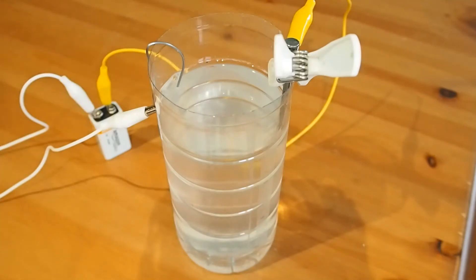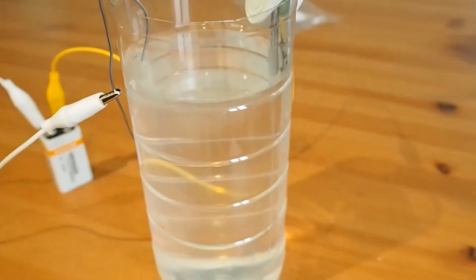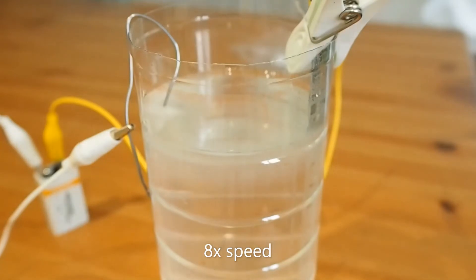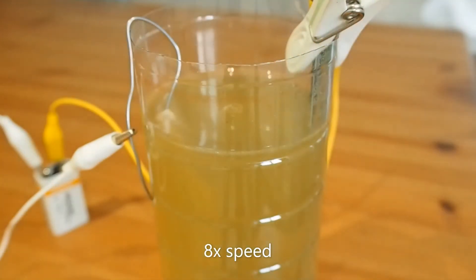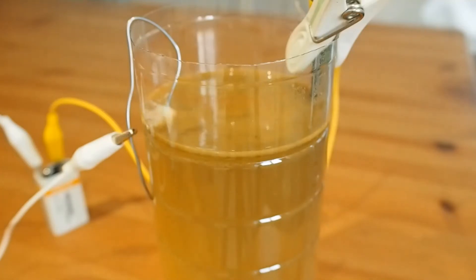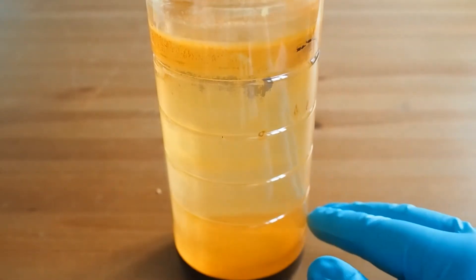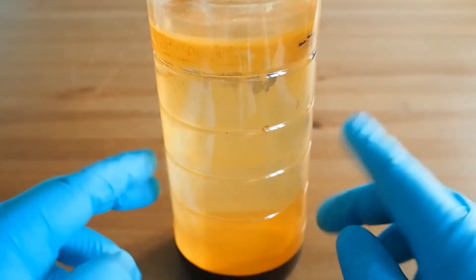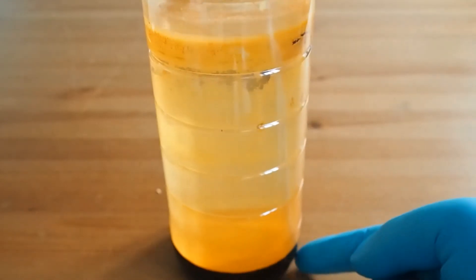I'm going to pull the camera angle down so you can actually see what's going on. So after about two days — it only ran for one night and then the next day with one additional battery — you can see there's all this orange material, which is hopefully iron oxide, and then there's a whole load of black material at the bottom.